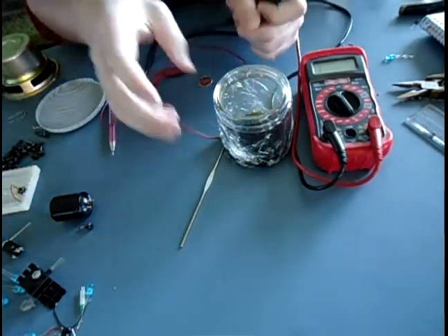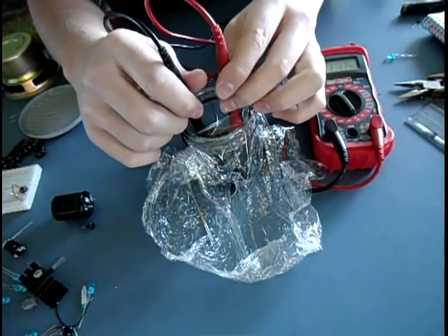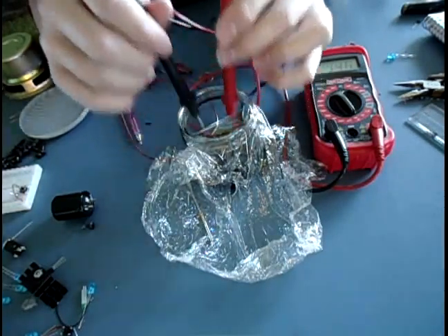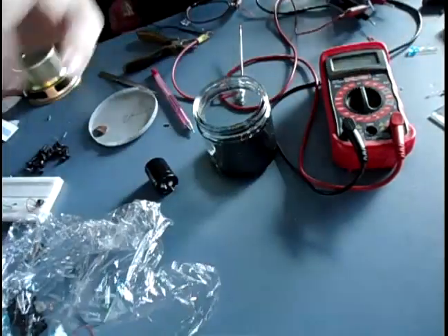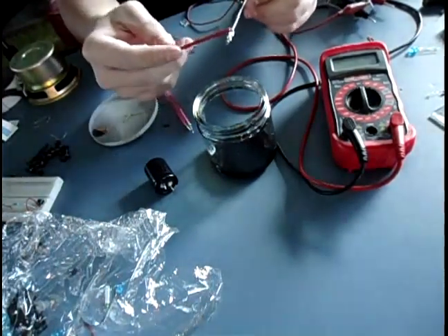I'm just going to kind of shove this thing into the ferric chloride. We got some reaction — not a whole lot, but we do have some. Okay, so I actually soldered a wire to our anode here. So now we're going to give this another shot.